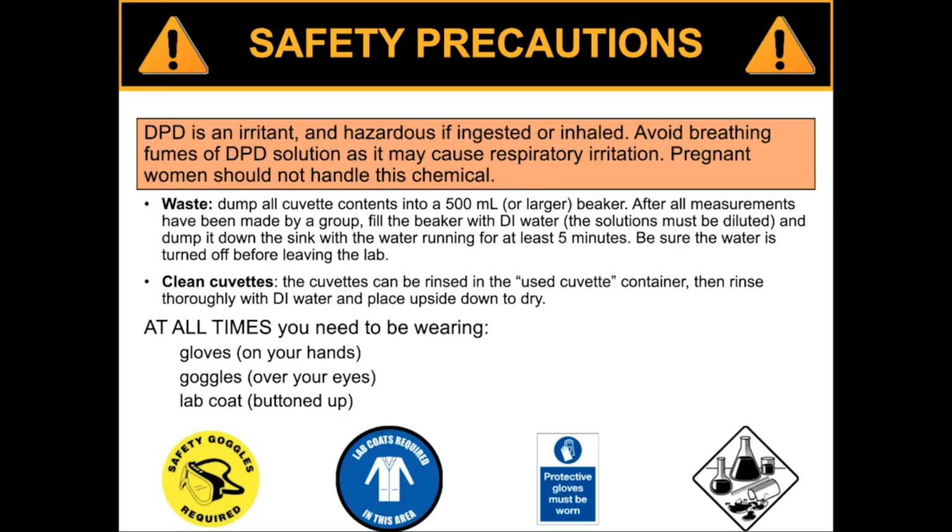Okay, last thing before you actually see video of the experiment, DPD is an irritant and it's a hazard if it's ingested or inhaled. So breathing the fumes of the DPD is not good, and it's not good for women who are pregnant to handle this chemical because it can harm the fetus.